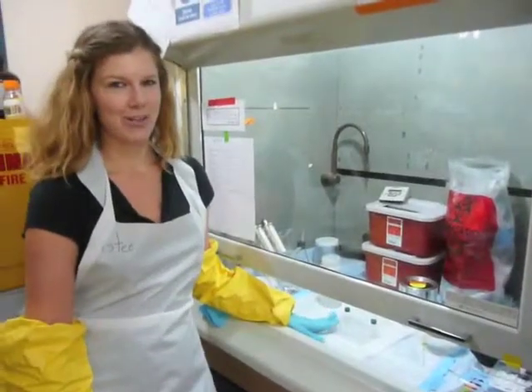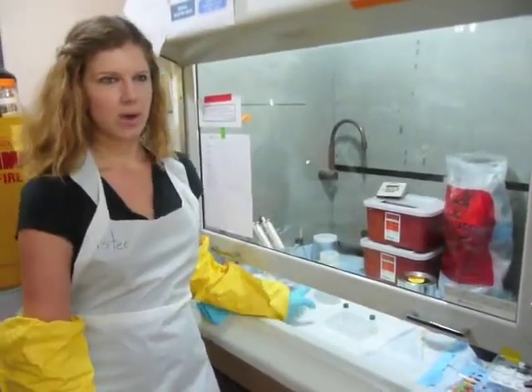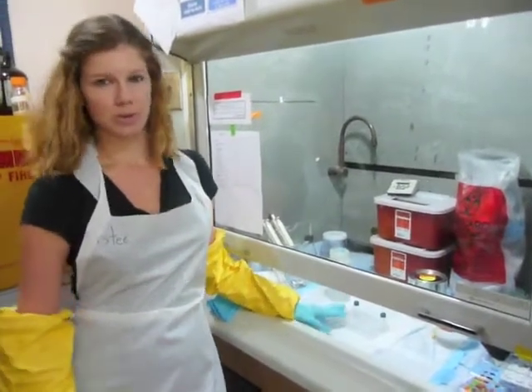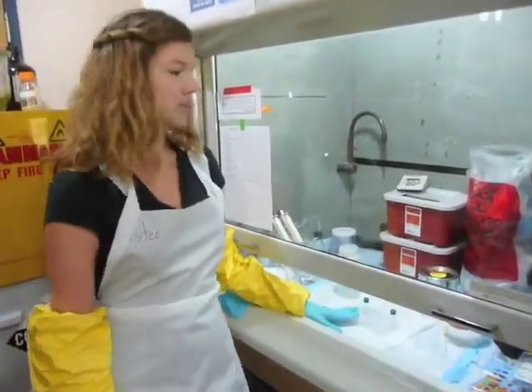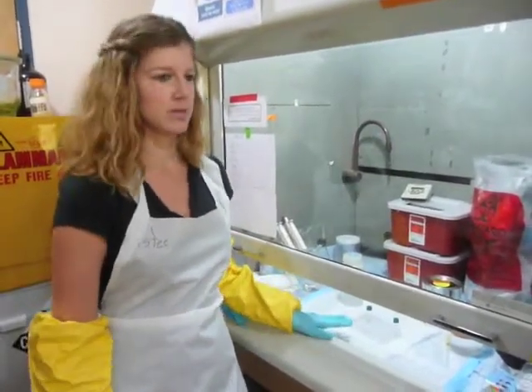The larvae are fixed in glutaraldehyde. We do four to five rinses with filtered seawater, and this is to remove the glutaraldehyde and also to remove any debris from the larvae, specifically any debris on the cilia.